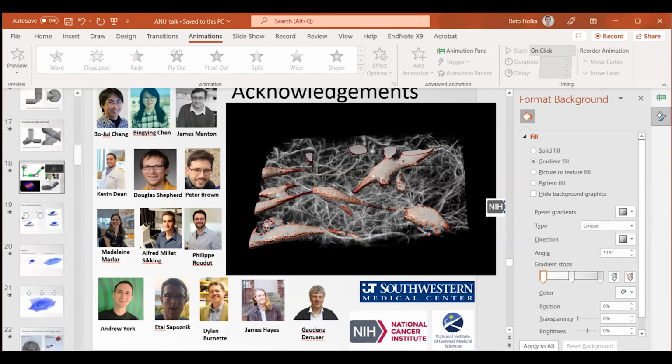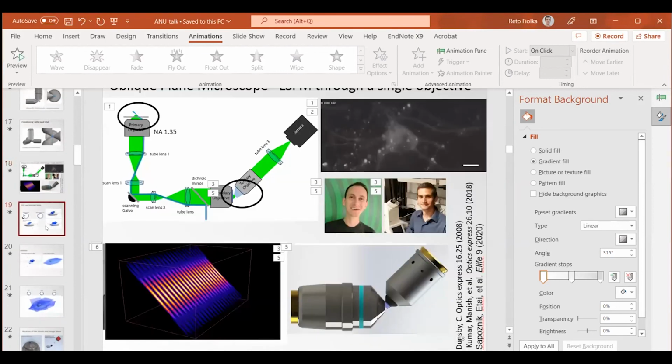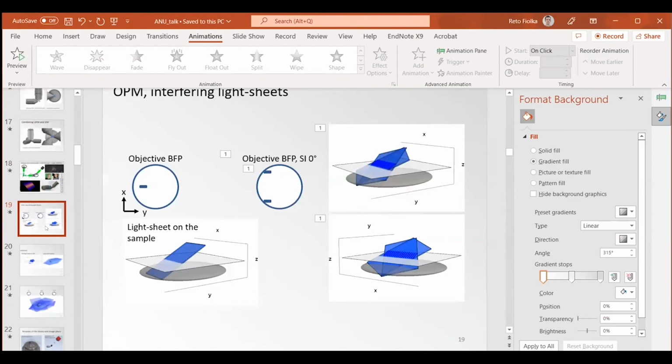Yes, I left that away, so my apologies. At the moment, this might be difficult to explain without the appropriate cartoon. In short, no. We currently use a Michelson interferometer with which we can create two beams, and each beam can be controlled with the mirrors in the interferometer to be positioned where we want it in the pupil.